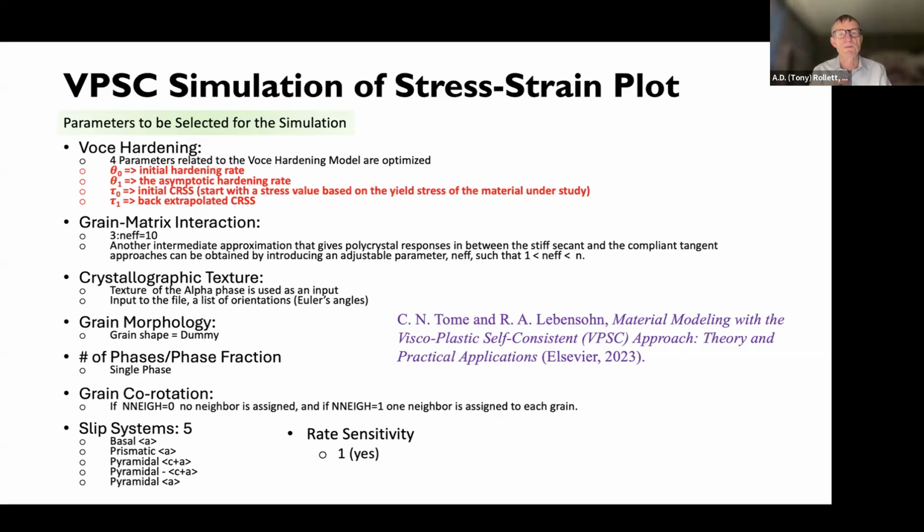There are, of course, much more detailed models that you can run, and one could, based on the EBSD. You could run finite element with crystal plasticity. You could run the FFT code that some of you know. But it's interesting and worthwhile to see if one can get close enough with this grain-based approach. And Carlos and Ricardo have published a nice book that you can read for all of the detail about the model, the mathematical basis and how to work with it.